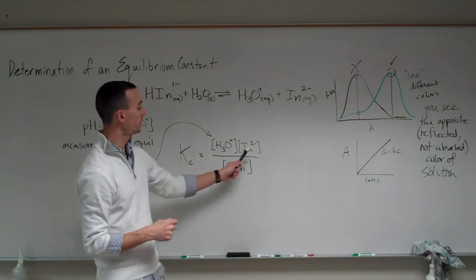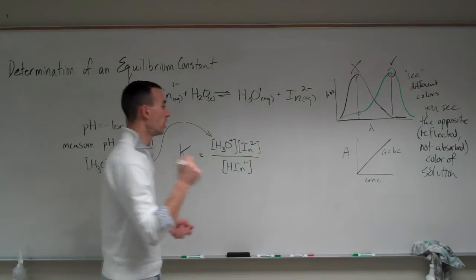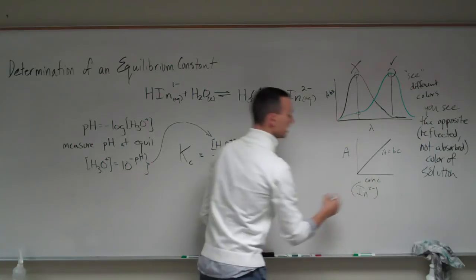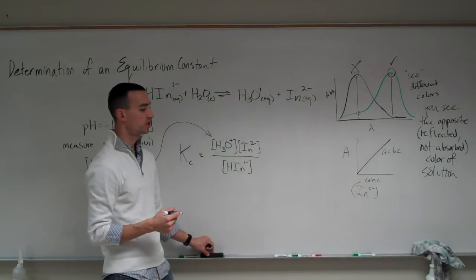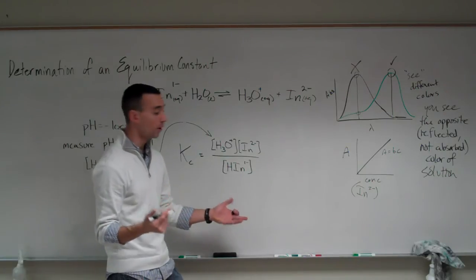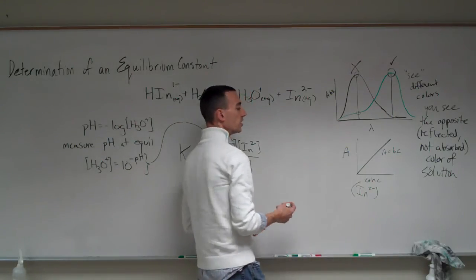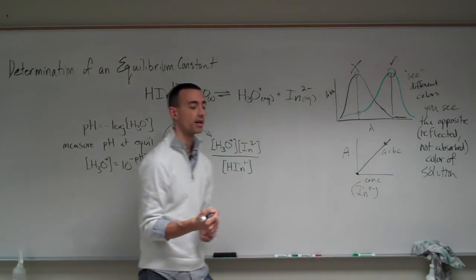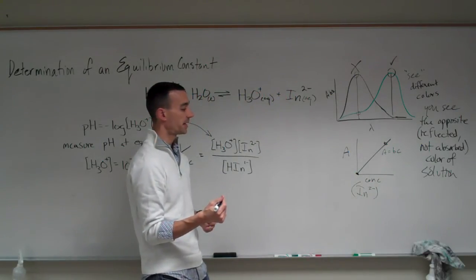measure, and for the IN-2, we should be able to make essentially a very quick and easy Beer's law relationship. We'll actually just do it for 1 point. Okay? For a single point, you can have essentially a graph through 1 point, and 0, 0 would be your other point. And that's how you'll get your B.